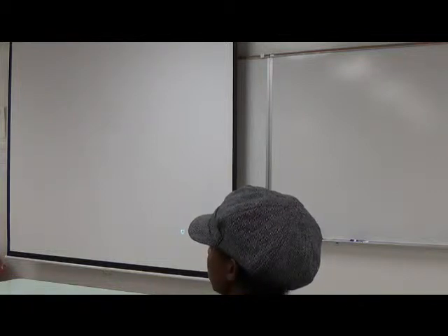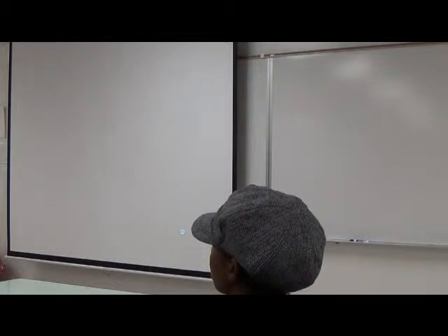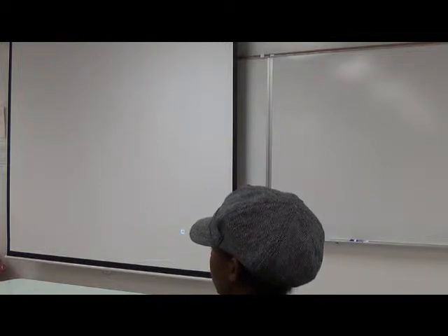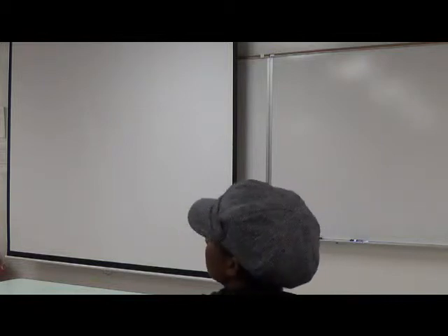Because this is a live animal type of experiment, I don't want to force anybody to do it who believes that they don't want to. Your frog experiment on the PhysioEx, the simulated one, is very similar with additional stuff. They have the transducer for the pressure, so it's totally up to you if you want to observe that.